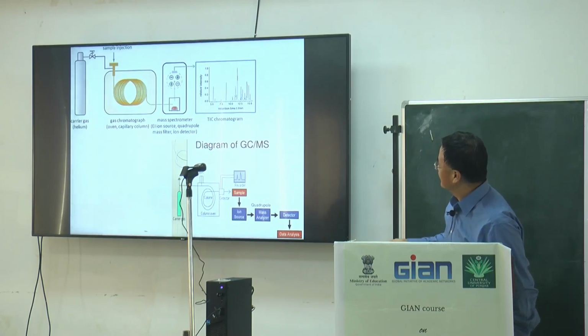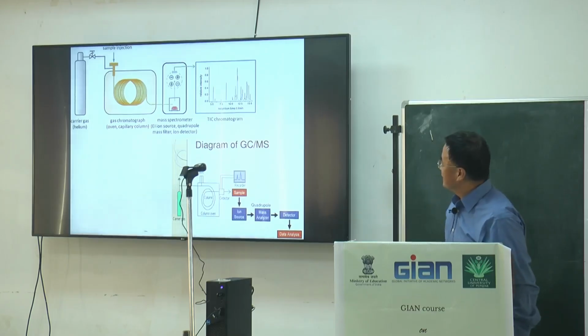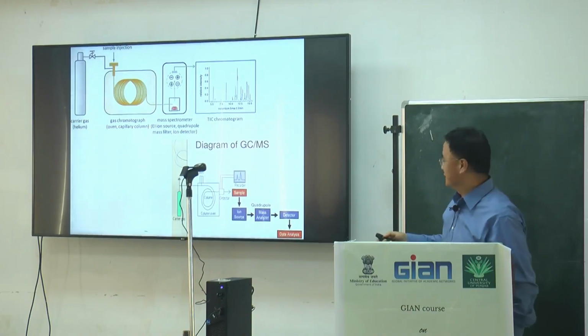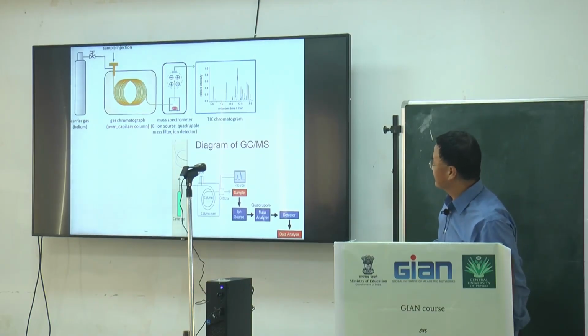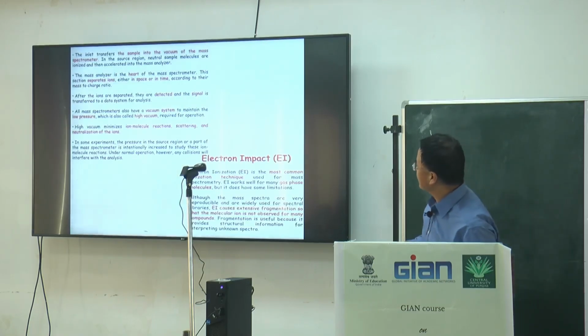Yeah, for those analyses, this GCMS only has one capillary column, but if you double those, you will achieve much higher resolution of the isolation or purification.